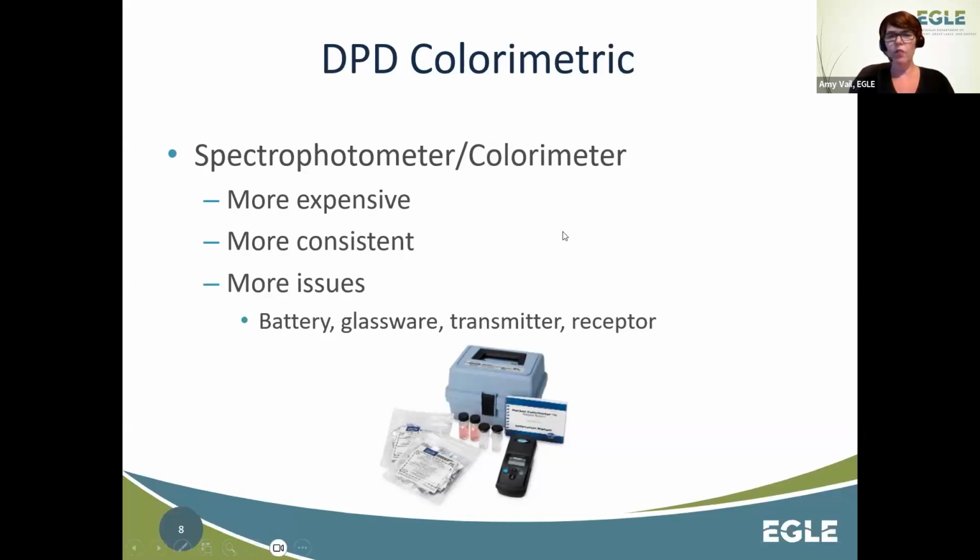And you can tell the difference. A lot of times it says right on it, like LR for low range and MR for mid range. And a lot of them you can switch between one and the other right on the unit. And the low range and the mid range, everything will read with 2 decimal points. The high range only has 1 decimal point.